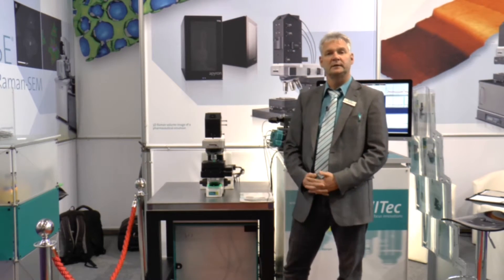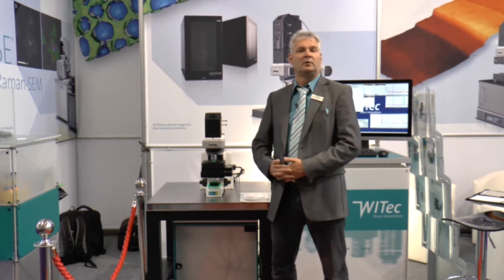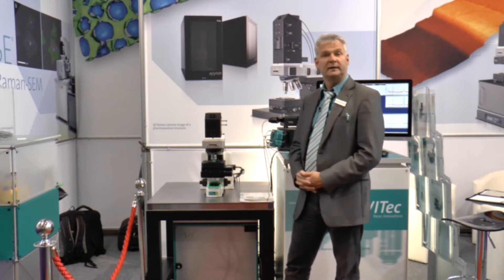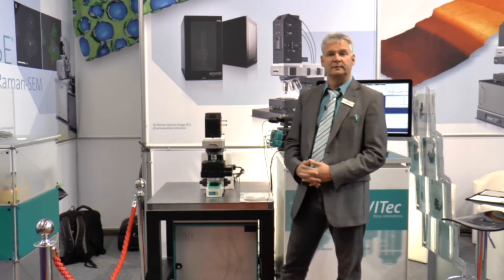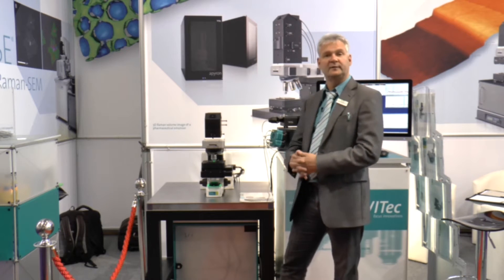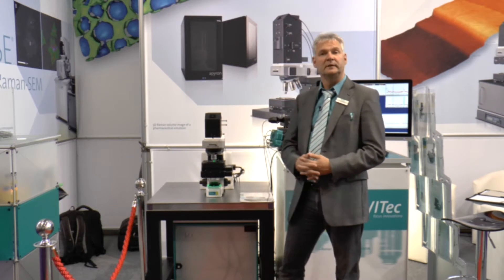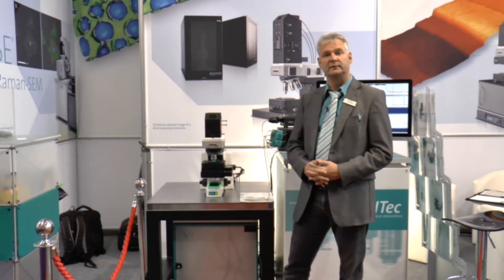With the alpha300 series, WITec offers a very modular series of confocal Raman microscopes that can also be combined with other techniques like AFM, SEM, or other techniques. Now we introduce the access system. As the name suggests, it is the entry to the WITec family of confocal Raman microscopes and it's not a dead end. The user can start with a very basic system but at any time can upgrade to any system in the WITec confocal Raman microscope series.